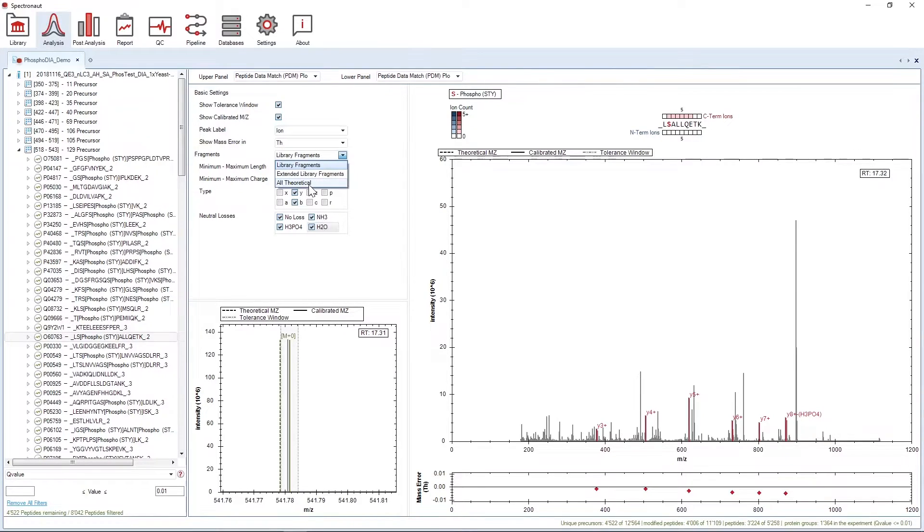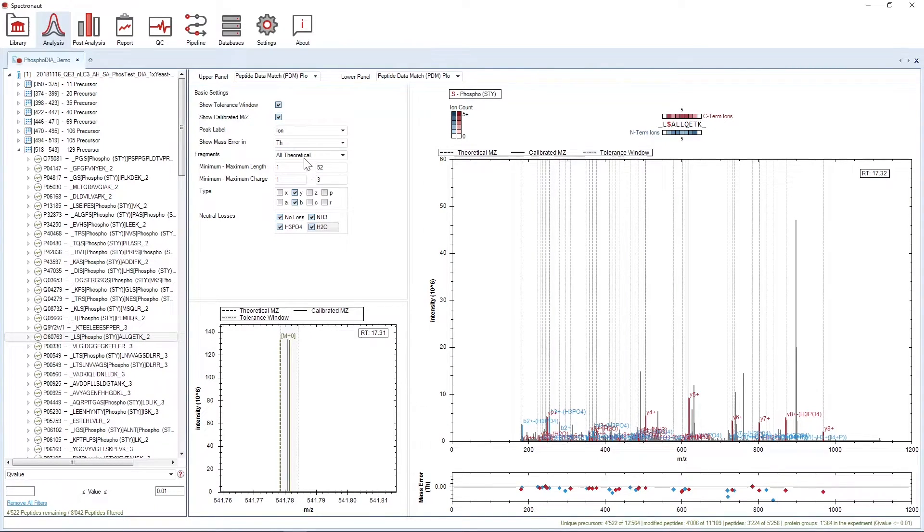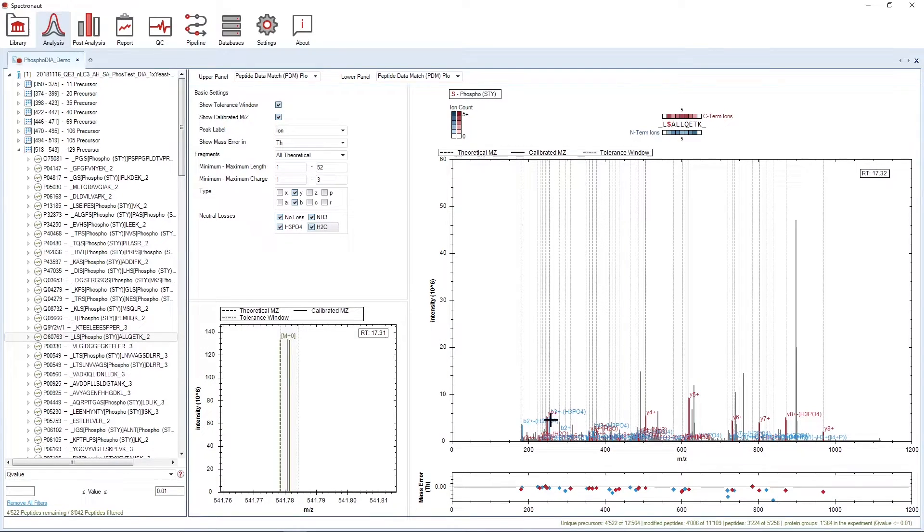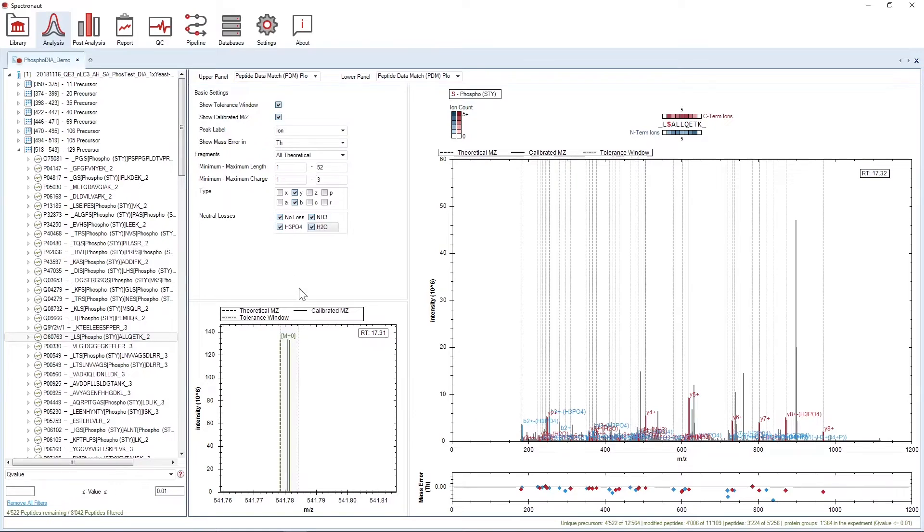Finally, you can also show All Theoretical. This will generate all theoretical fragments from the current precursor and tries to map them to the spectrum. As you can see, the fragments that can be matched with a measured peak are displayed at the same intensity as that measured peak.